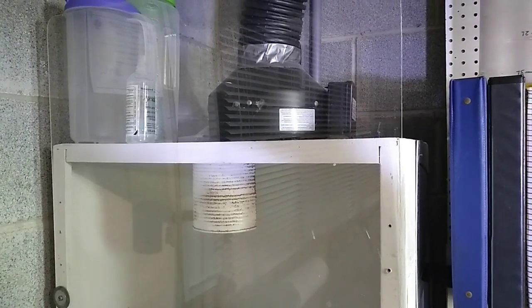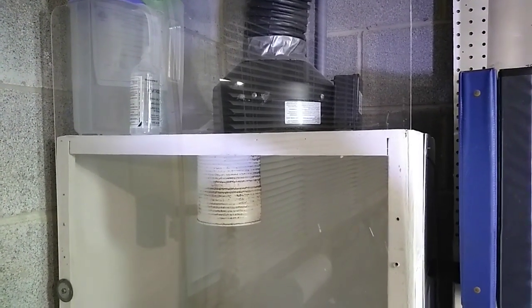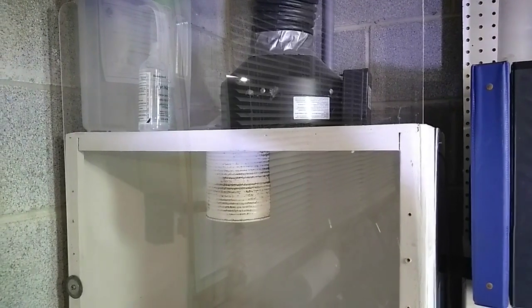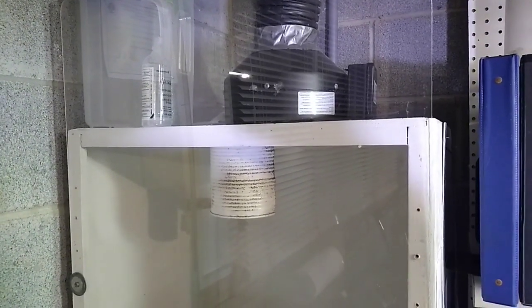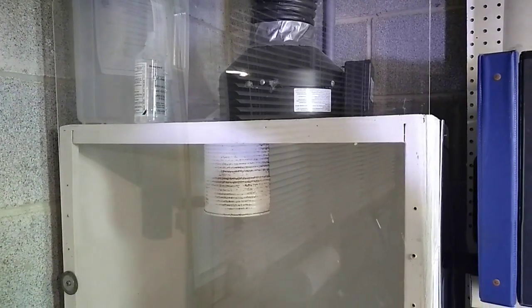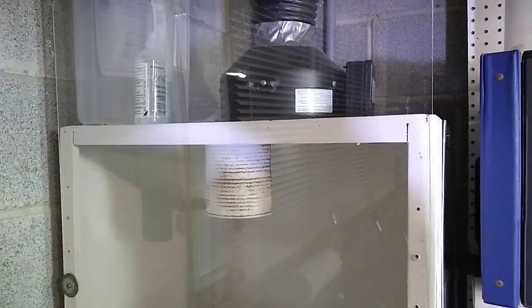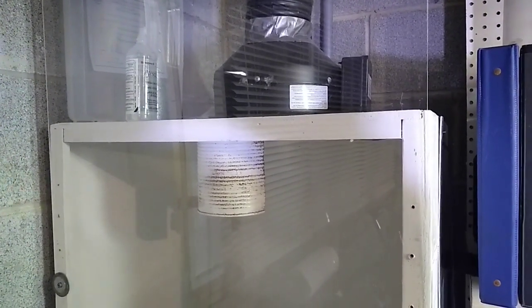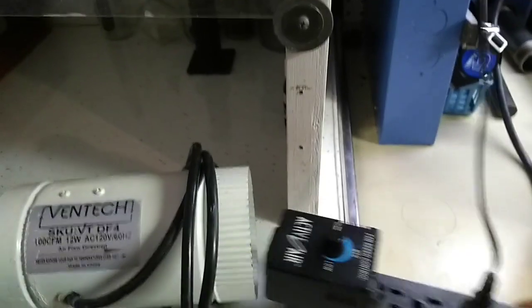As far as the fan goes, this is a Hurricane brand 4-inch exhaust fan. It's not explosion proof or chemical proof, but for what I'm using it for, it seems to do a good job. And it's rated at 171 cubic feet per minute, which is plenty of airflow. In fact, I actually scaled it down with this speed controller for fans.